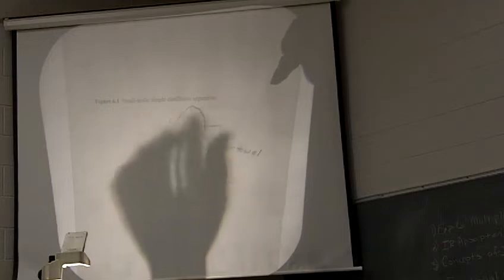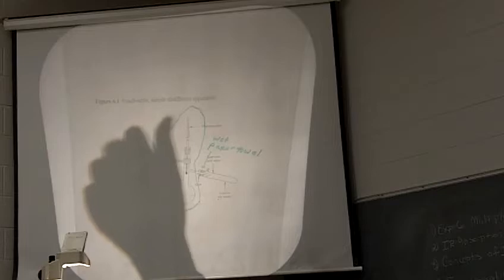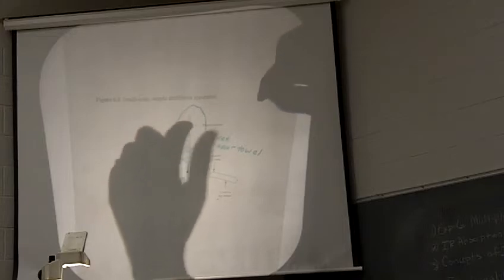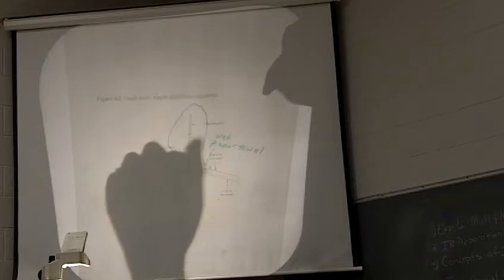So if you add heat and after a few minutes don't really see any response, then you need to keep adding heat, okay? So you have to keep turning up the dial on your Ohmite. Your thermometer, you're going to use the regular thermometer you've used before, but you're going to have the stopper adapter, so we'll show you that. Make sure that thermometer tip ends up underneath this arm so that you're getting a good reading, because this is how you'll determine the boiling point. So you need to make sure you're getting a good boiling point temperature for the reading, okay?